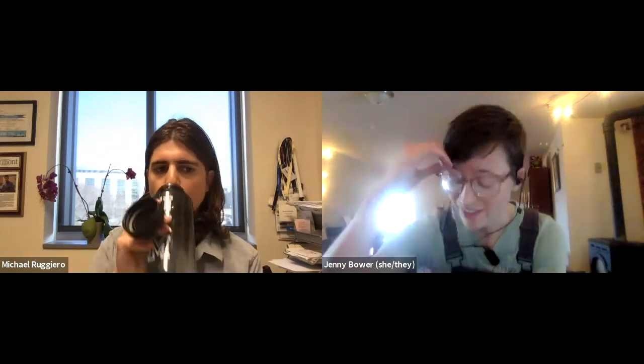I did want to kick off with one of my own, which is, I can already see how there's relevance with soils, which I study, and particularly clay minerals, which are really hard to study in heterogeneous mixtures using powder XRD, for example. But I'm wondering, I have these amorphous iron and organic matter compounds in the soils that I think might be really good at capturing phosphorus. What about poorly crystalline materials?